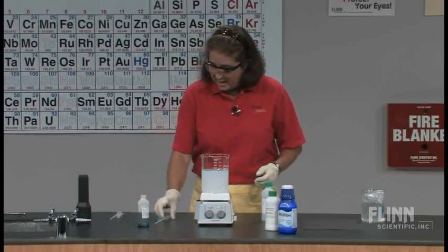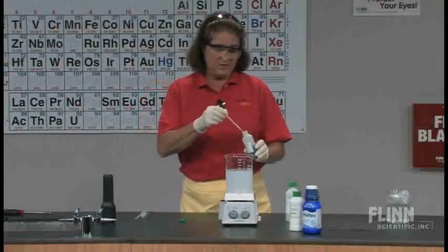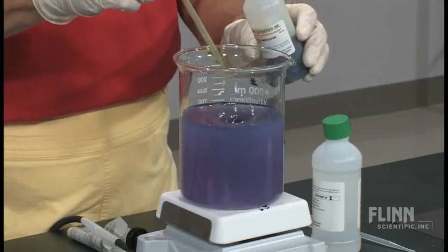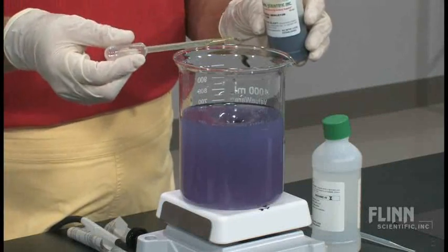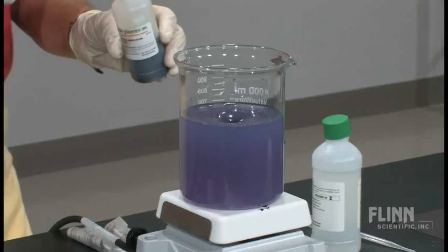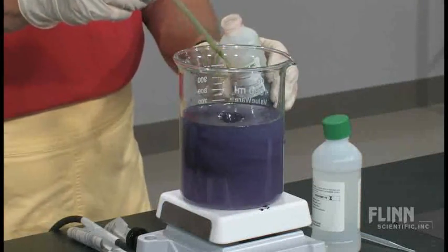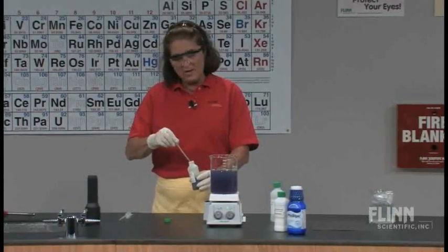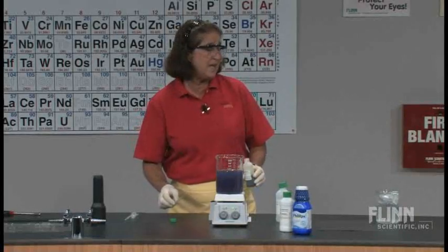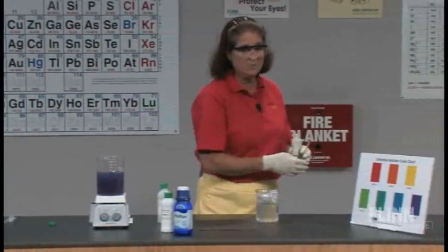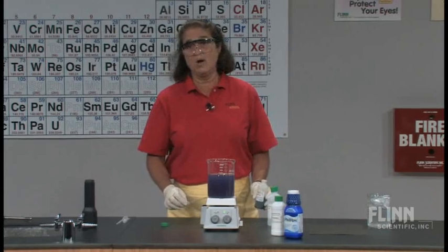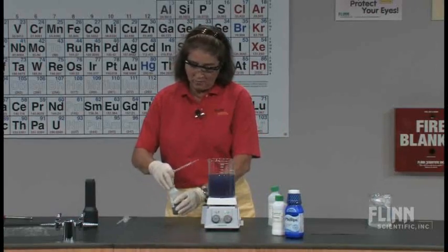We can test that — we're going to add some universal indicator. And what we find is that the color we have here will not be as dark as if we were adding sodium hydroxide, lithium hydroxide, or potassium hydroxide. I like a couple of good squirts here to give me a nice vivid color. You can see that what we have here is probably something about a pH of 10. When we have this shade of purple on the universal indicator chart, we're looking at a pH of about 10. If this were sodium hydroxide, we would expect something more towards 12 or 13. So we're starting off with a pH of 10.